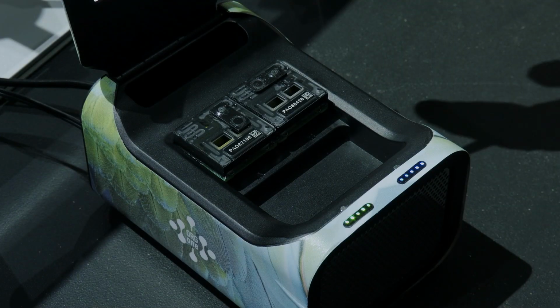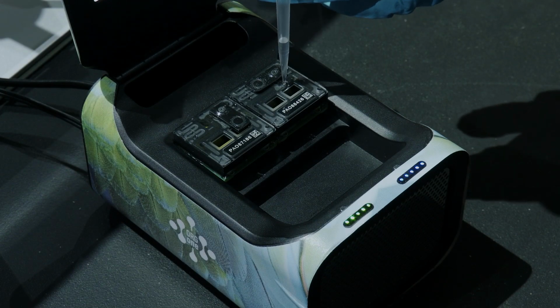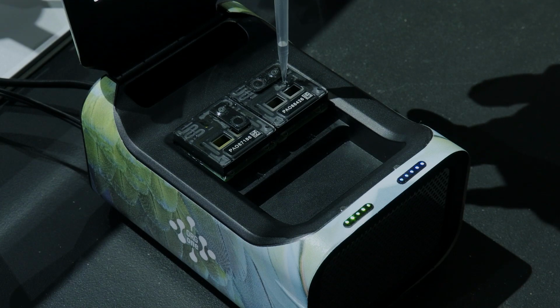Like I said, we probably have 3 types of users: those with samples, those with sequencing capacity, and those with bioinformatics capacity. And any one user can have 1, 2, or 3 of those. So we aim to join those people together, and in this demo, we're trying to demonstrate that. We've already loaded this library to demonstrate that sometimes some samples need greater sequencing capacity, and with the P2 Solo that we're using here today, we're aiming to deliver this.